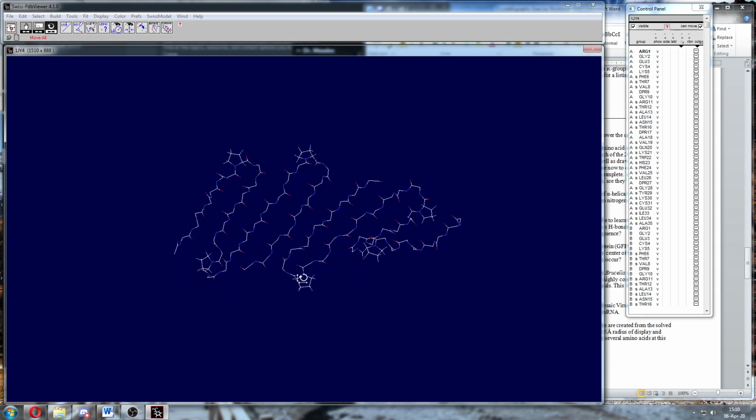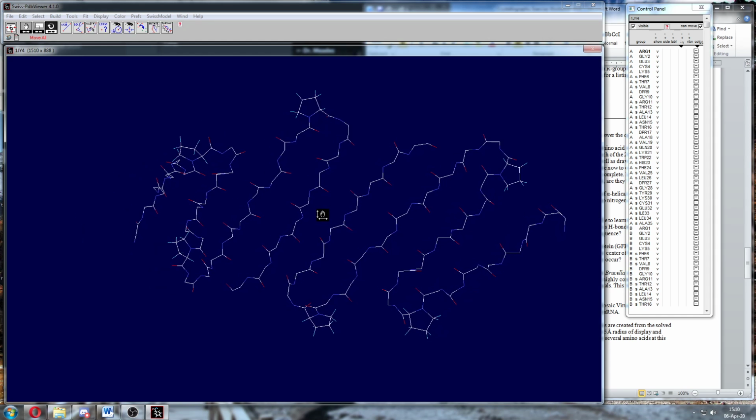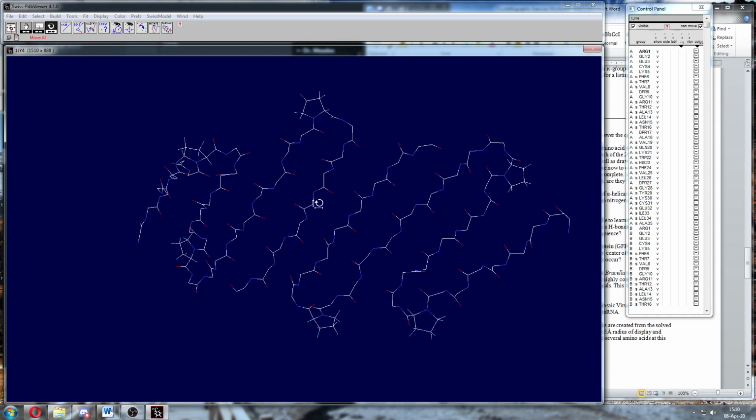Right, now is this protein made of parallel beta strands, or are they anti-parallel, or is it mixed? How do you figure that out? So I first need to figure out which direction the strand's going. So let's just pick the strand in the center, the one in the very center here, this one, and see which direction it's going. So I find nitrogen, carbonyl, alpha carbon. That's backwards. So nitrogen, alpha carbon, carbonyl. Nitrogen, alpha carbon, carbonyl. So this strand in the very center is going from top to bottom.